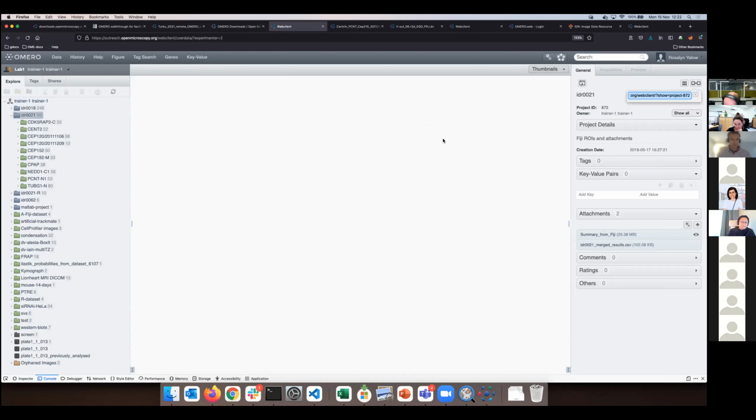Some things will be possible to be done via JSON API, but everything will be possible to do by other APIs if you have other possibilities, such as scripting in Python, connecting to the server, and then creating a ton of key value pairs or retrieving them. We have examples of such work against the IDR. Jean-Marie created some Jupyter notebooks which show how to work in this way with key value pairs.